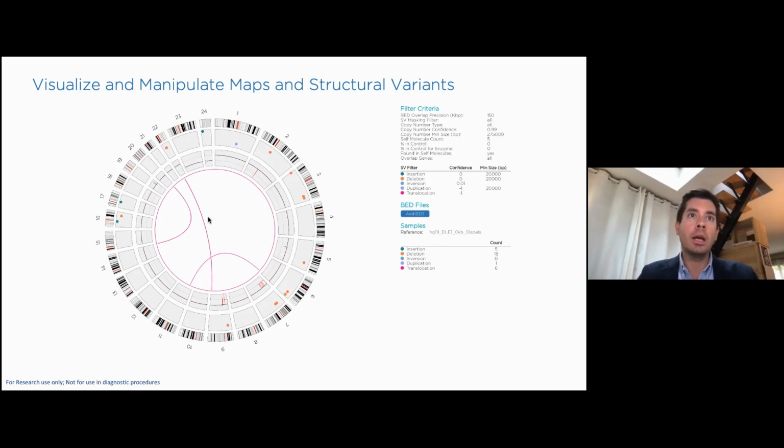Every time you click on one event, this opens the map, giving you a much higher resolution of the event. We will see a few examples.